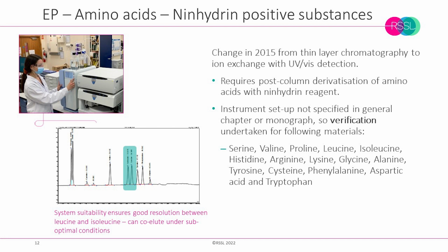As the method is detailed within the general chapter for amino acid analysis, and specific chemistries of eluent or column details are not provided, it was necessary for us to verify this solution for the entire range of amino acids, which required testing before offering this testing to our clients. This obviously incurred a significant time investment on installation, but allows us to be fully compliant for all our customers without the need for separate client or material-specific verification exercises.